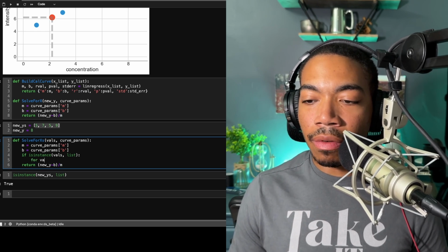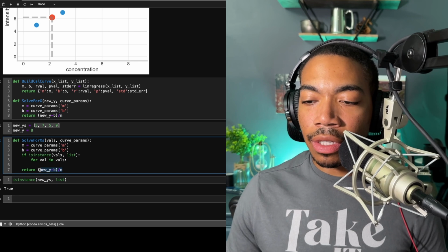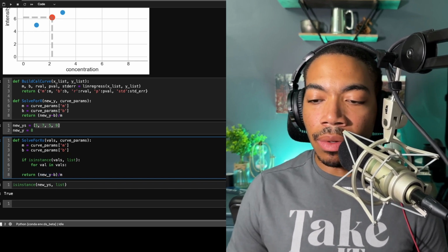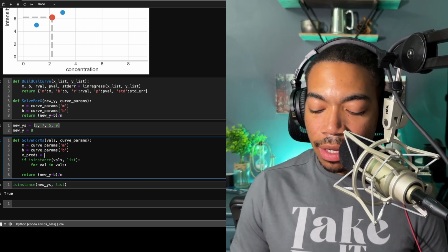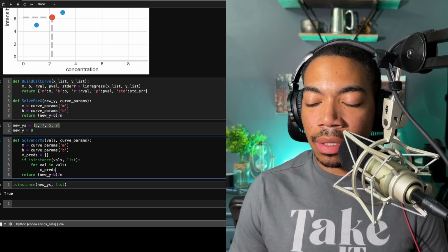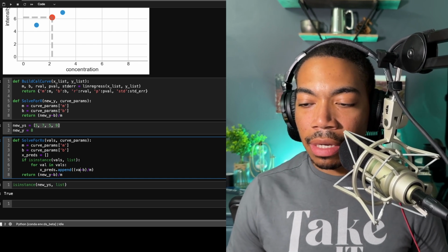We'll say for val in vals, we're going to leverage this equation, and I want to create a new list called X preds. So predicted X values will be an empty list. So then I will append, X preds dot append, and we'll append this equation. And instead of that, we'll just pass in val.